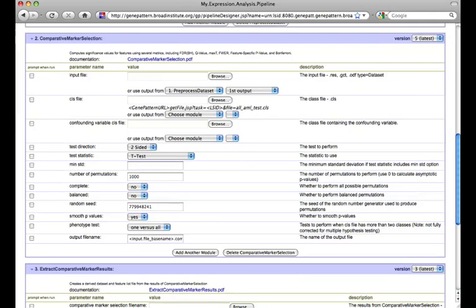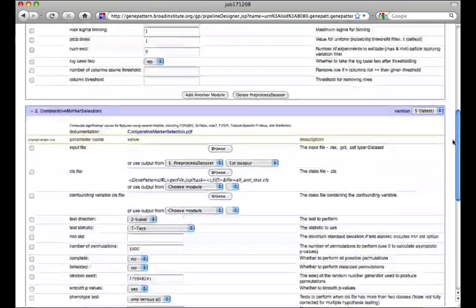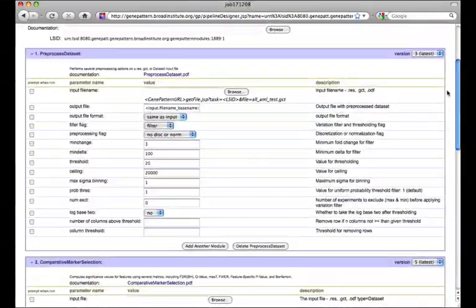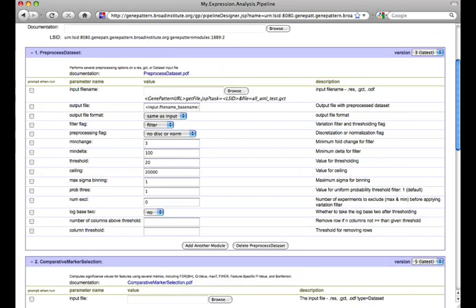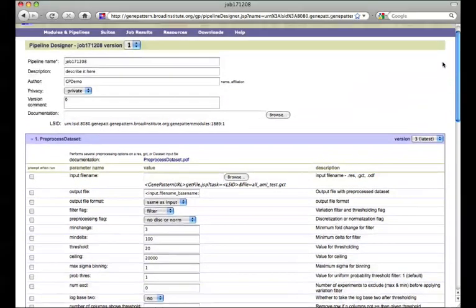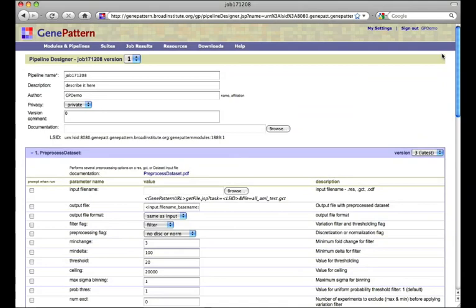This recreation is possible because we used the output from one module as the input for the next. That action allows GenePattern to retrace the steps that created the result file and recreate those steps in a pipeline. For more information about the logic behind this, please visit GenePattern.org and see the Create Pipeline section of our user guide.